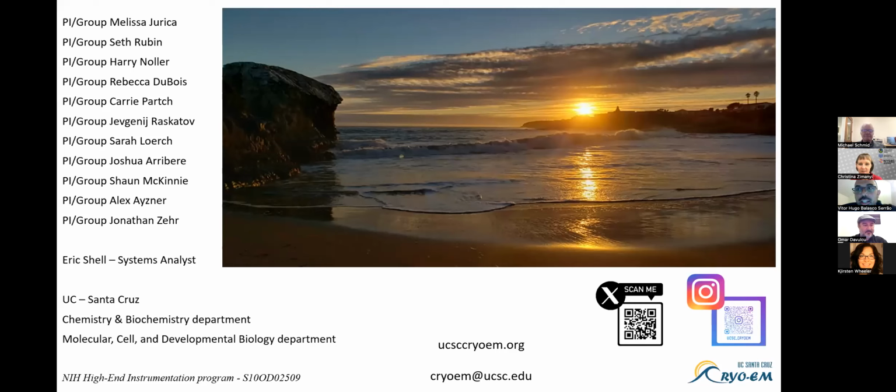He tried in situ proteolysis, he tried different constructs, he tried several things, and unfortunately never got crystals that diffracted. By the time he was leaving the lab, I joined this project. He let me keep playing with the crystallography aspects of that. I tried several times and I couldn't get any single spot either.